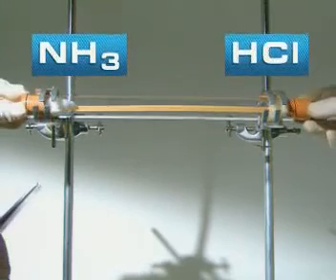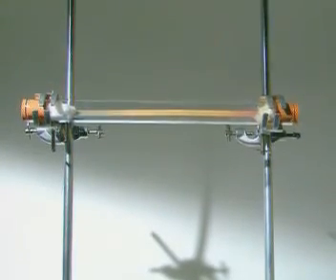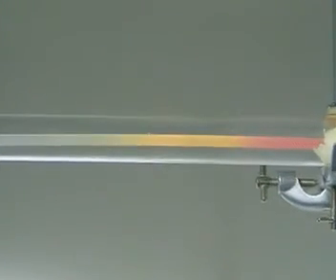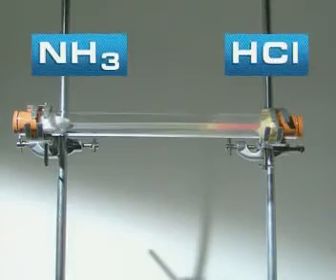Another way of monitoring the progress of the gases is to run a piece of damp indicator paper along the tube. Hydrogen chloride gas turns it red, ammonia turns it blue. Why does ammonia travel faster?